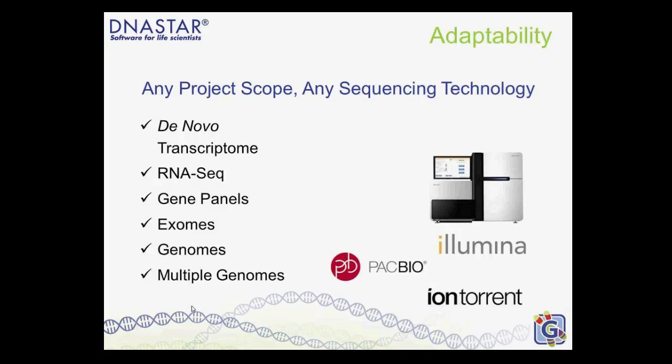The software platforms, of course, Illumina is the main source for transcriptomic data. Illumina is the only one that produces enough coverage across the transcriptome to find those low to moderately expressed genes. And so it's typically Illumina, oftentimes HiSeq data that's produced in very large quantities.